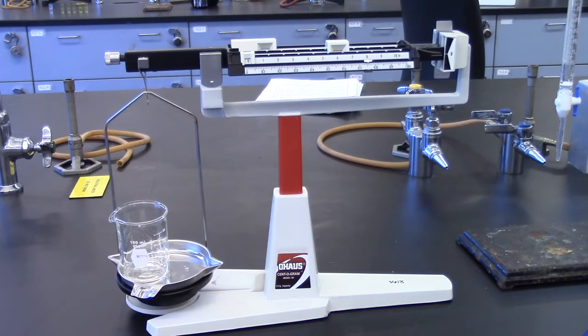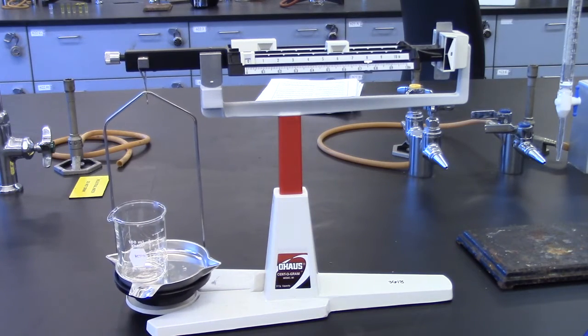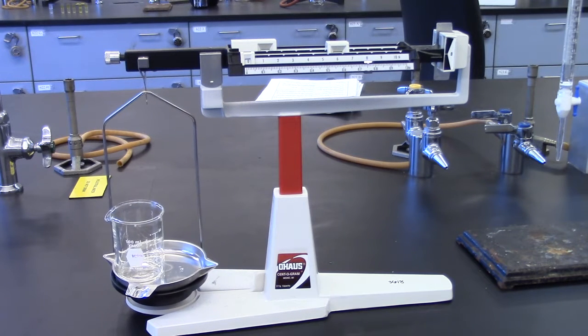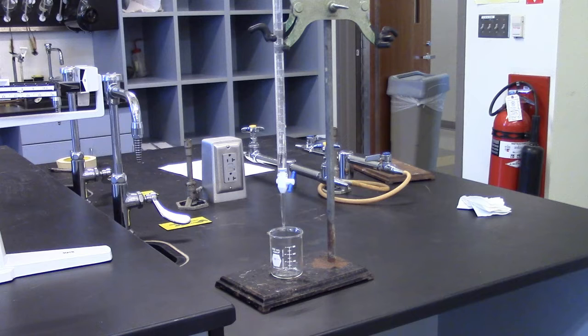After you have measured and weighed five 10 milliliter samples, empty the 100 milliliter beaker and dry. Weigh the empty, dry beaker and record mass.